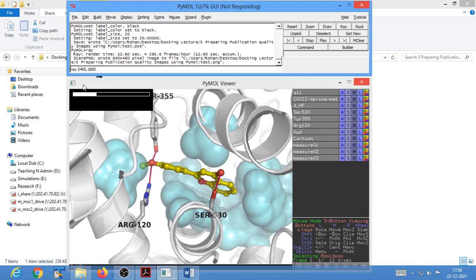Okay, you might need to be patient when these things happen. It might take some time, or sometimes this software crashes also. Well, let us keep our fingers crossed and hope that this software will not crash and it will ray trace the image in the dimension that we need. You just need to be patient.